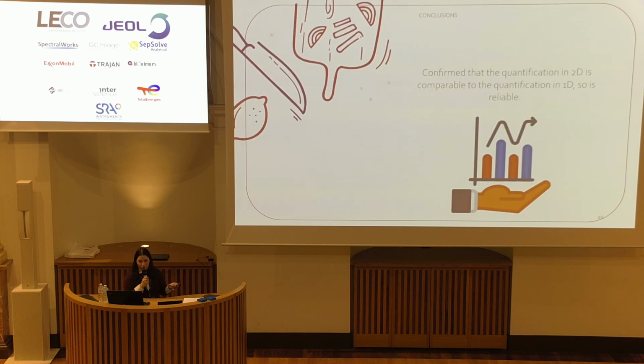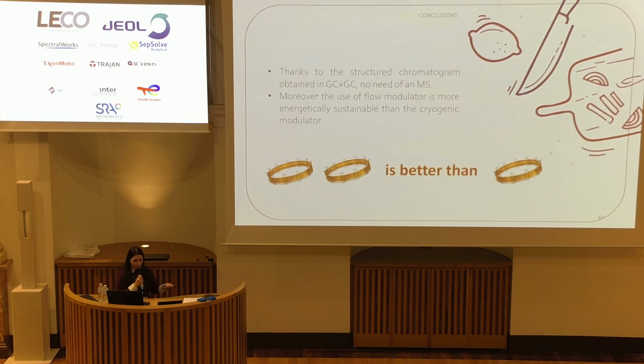We also can confirm that the quantification in 2D is comparable to the quantification in 1D, so it's reliable. But we also have other advantages, for example, the structured chromatogram in GC times GC can make us not use an MS, and also the flow modulator is more energetically sustainable than the cryogenic one.